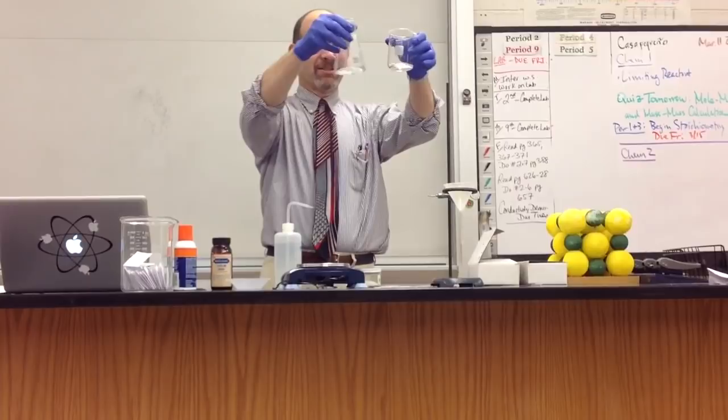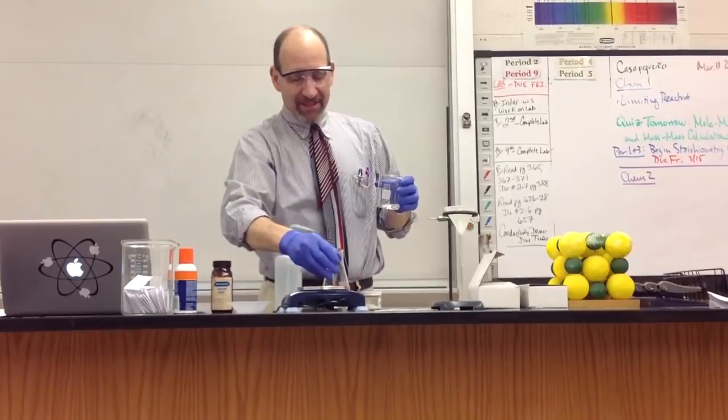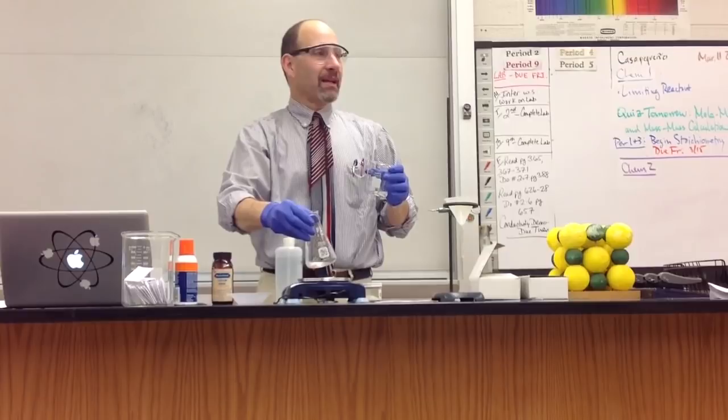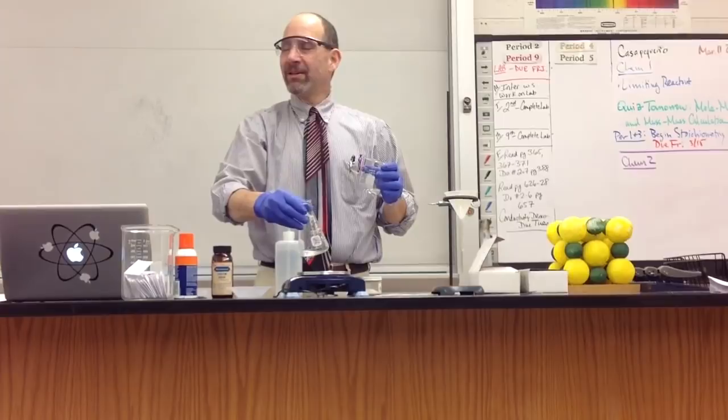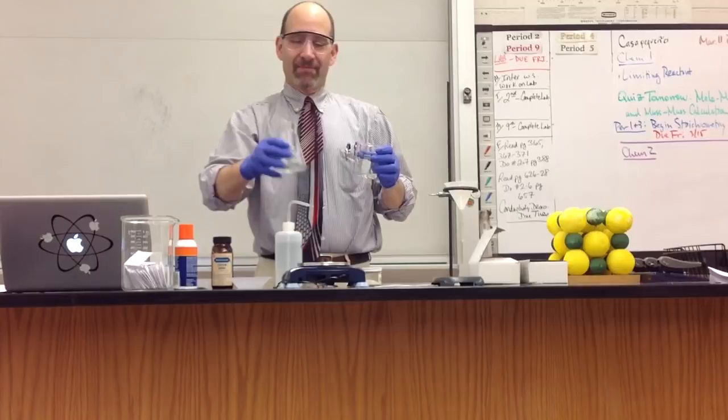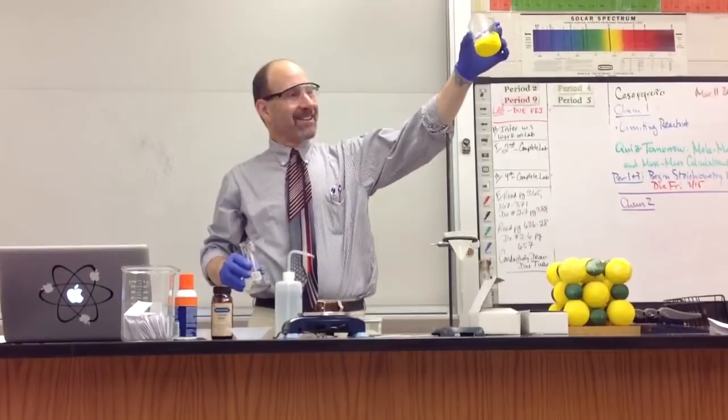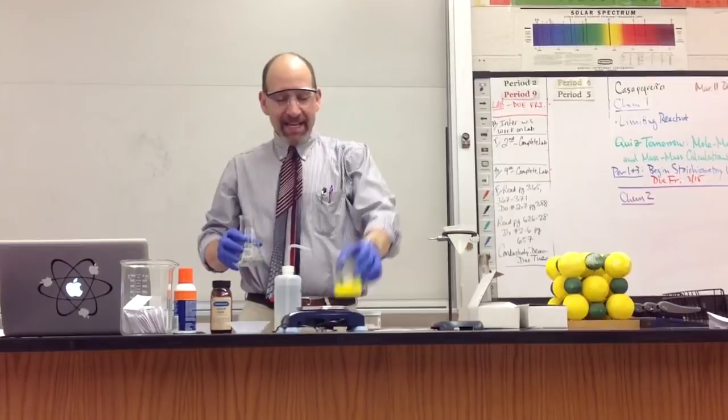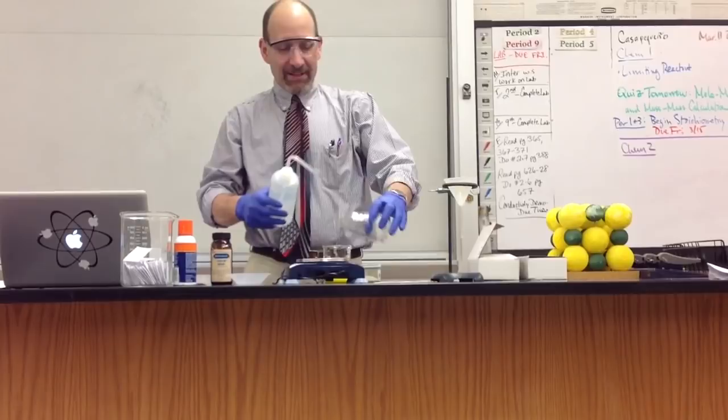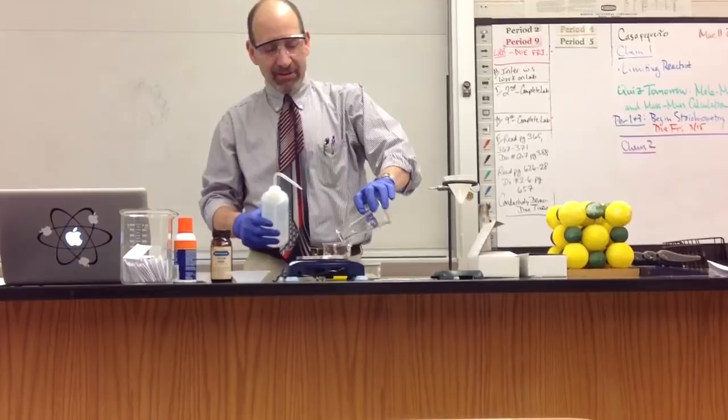Now, here's the cool part. When you mix the two of them, you may have heard that there's problems in old houses with lead paint, right? Have you heard about lead paint problems? Why would they use lead in paint? Here's why. Look at that color. Isn't that pretty? Everybody see the color? Mr. Rinaldi, can you see it on there? That beautiful yellow. Lead salts can often make a beautiful, beautiful set of colors and very vivid colors. By the way, I'm rinsing out, making sure I clear out all the lead salt from here.